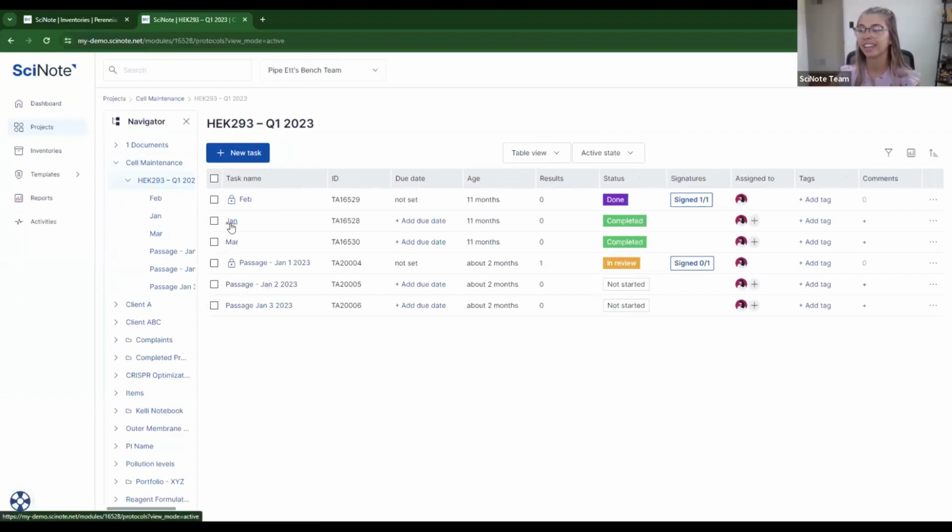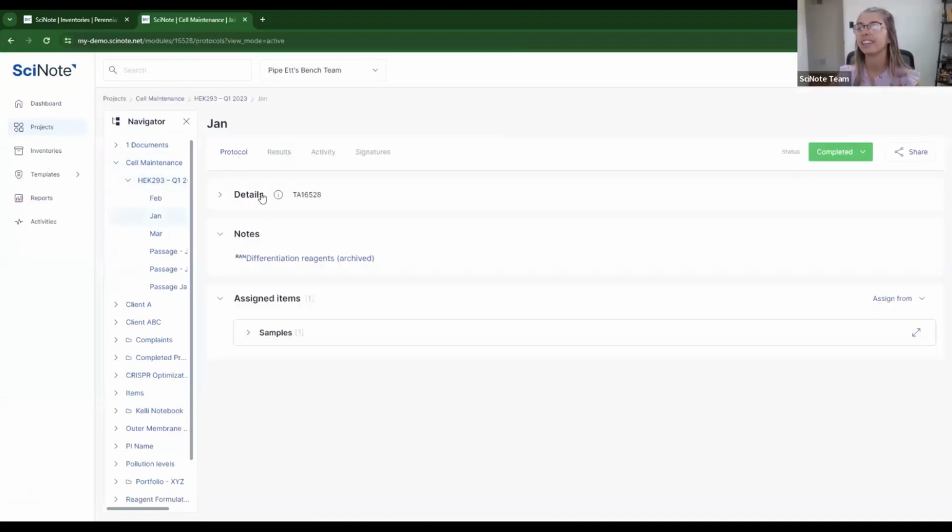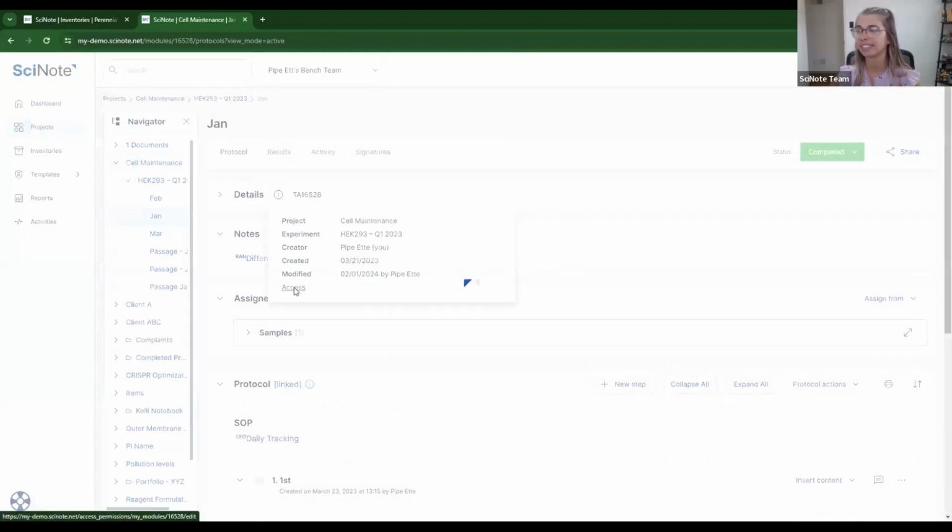And then even down for the task, I can go in here and go to my access.